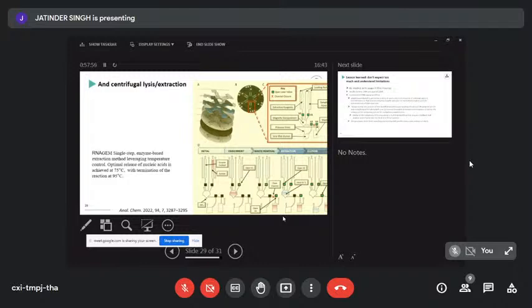I think this system through GIAN was FDA approved in 2019 or 2020. So it took a complete re-engineering of the system. Parts of the chemistry had to be revisited. In 2006, everybody was convinced we're almost there. No, because the whole community, no one had gone this far before. So no one had realized that actually having pumps is a pain and it's making it really expensive. It requires really complex control systems. We have to go centrifugal to make it fit the budget.